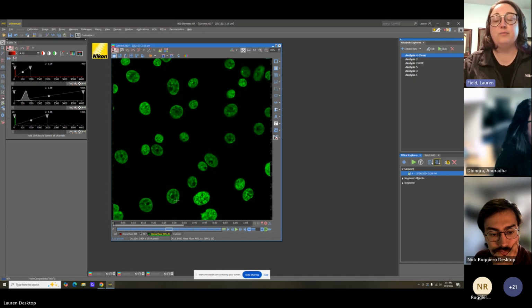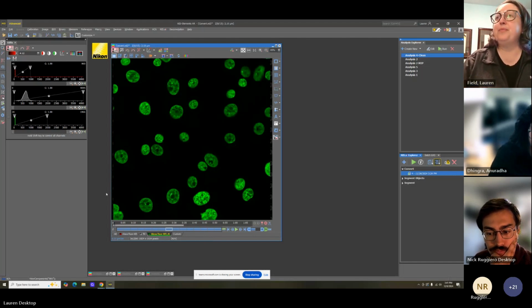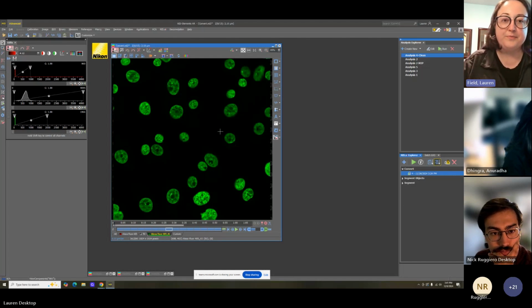So these ones are much easier to train than the segment where you have to be very specific in the binary that you are generating. Does anybody have any questions about this convert or enhance? They are the easiest ones to play with. You basically just need to give it pictures in order to train these.